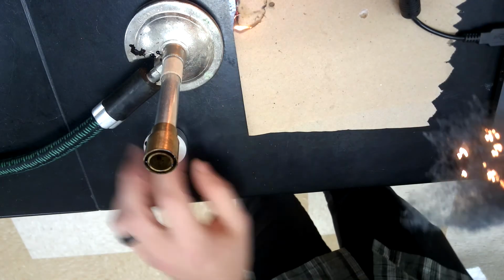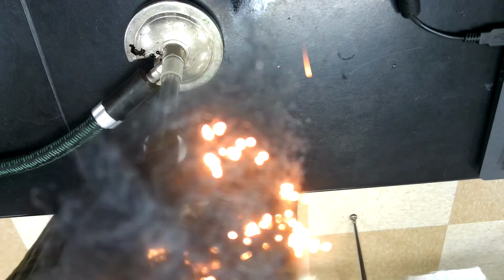As Mr. Wilson starts a fire across the room, that's okay. We got water over here. You can tell during this lab there's a lot of fire that goes on, and when I'm trying to do it in enclosed spaces, it's not as safe. So I actually had a small fire going on. I called my teacher over, and he dealt with it.